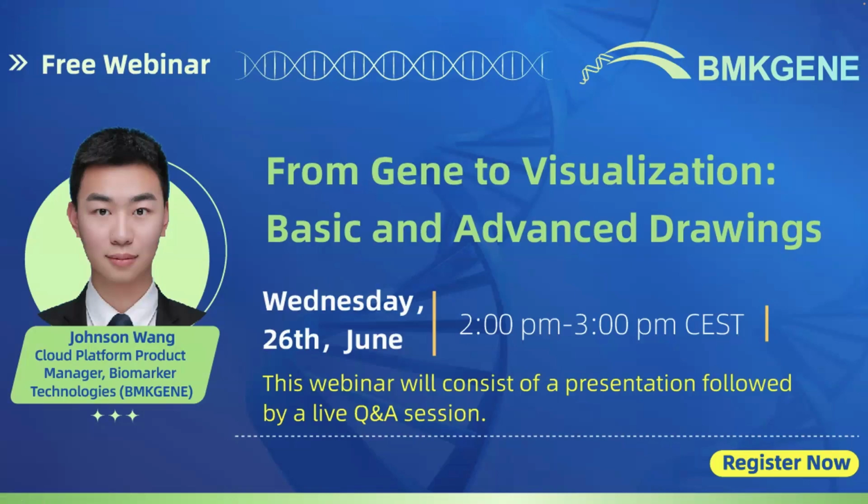Last week, we discussed the process of gene filtering. Now you have a gene set based on your selected parameters, but how can you visualize the results of these genes? How can you customize images to suit your needs? Let's address these questions step by step.